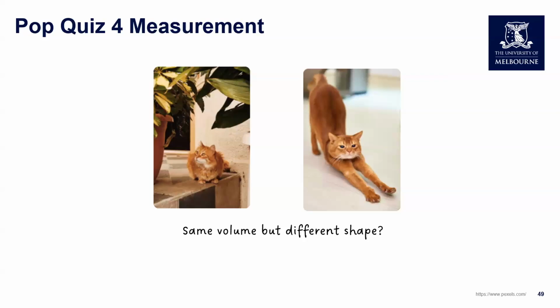So this one has a bit of differences. The first answer is that it measures the interaction of two molecules. Now, as mentioned, it's not really a measurement of molecular interactions. If someone wants to measure the interactions, they will have to use a completely different type of microscopic experiment like FRET, where the signal actually turns on and off based on the molecular interactions.